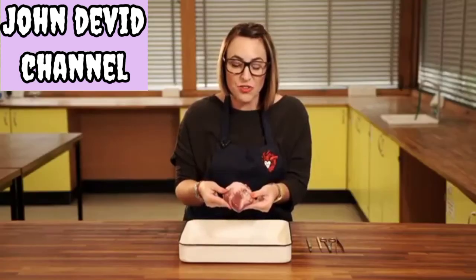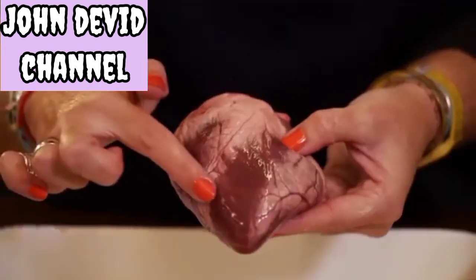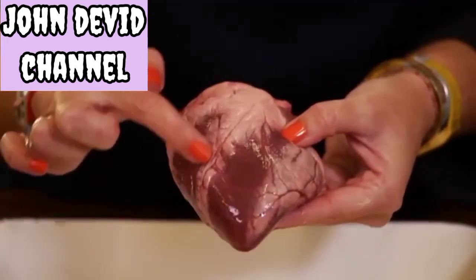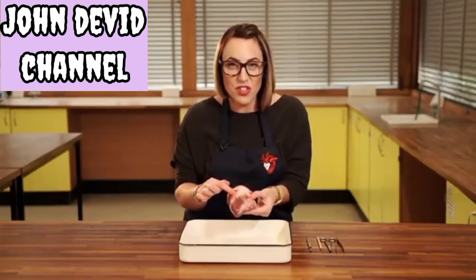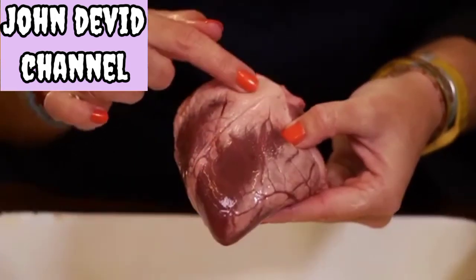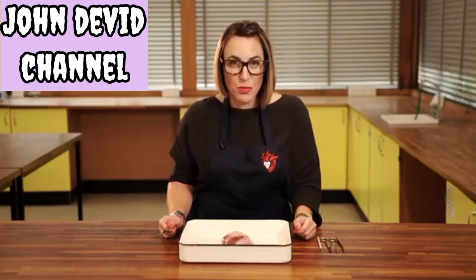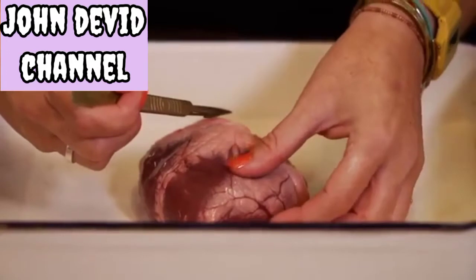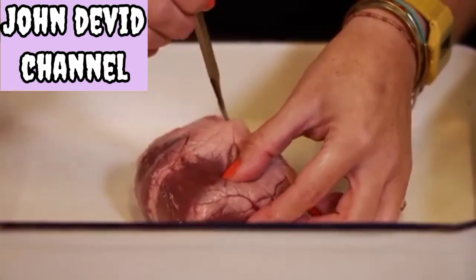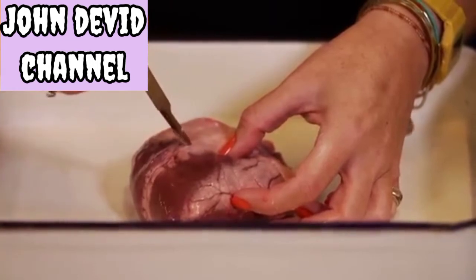When you come to dissect your sample so you can see the four chambers inside — those four rooms of the house — you want to look for that fold that goes slightly diagonal along the front. This is our interventricular sulcus and it's a useful guide to cutting so we can separate the chambers inside: the ventricles and the atria. When it comes to cutting open your sample, be very careful using a scalpel. Always cut away from yourself, and we're going to use this sulcus as our guide. Make an incision just slightly to the side of this dip in the middle.